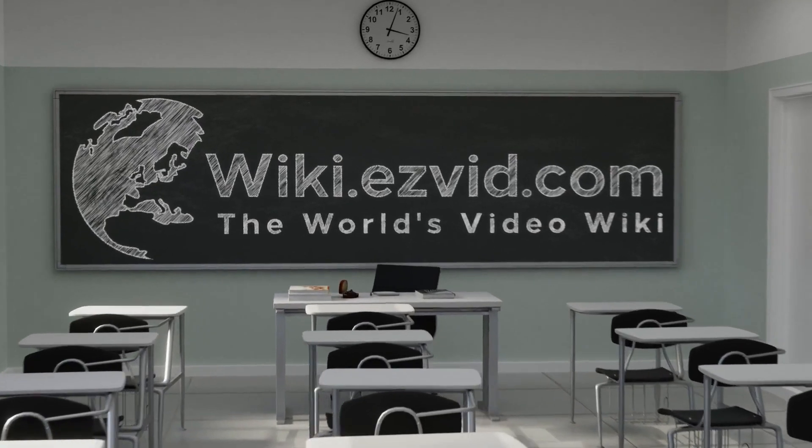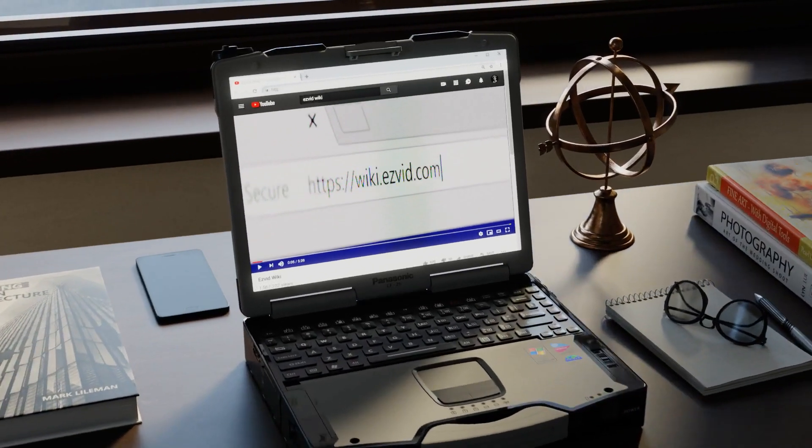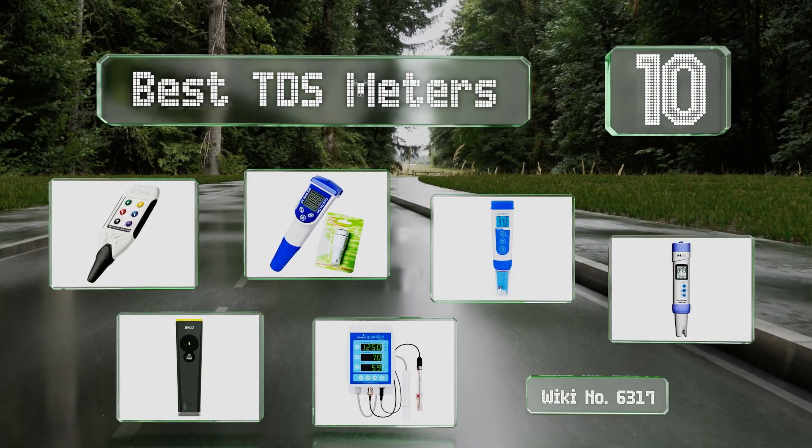EasyVid presents the 10 best TDS meters. Let's get started with the list.